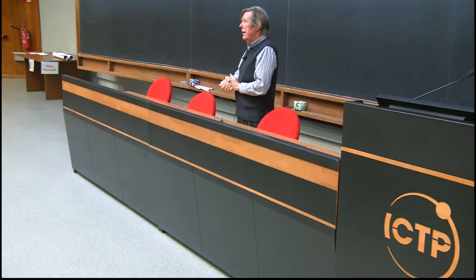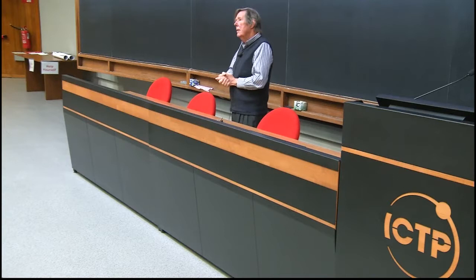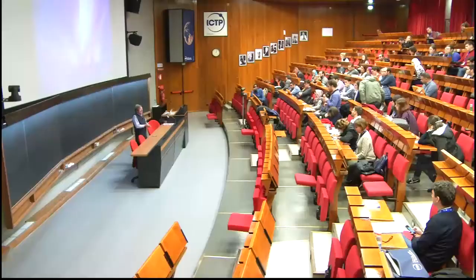Can you? No. The direction of the illuminating light in fluorescence is always the same. You cannot play with it. I don't think so. Can we? Can you have fluorescent dark field? No, you can't. That wouldn't work. Okay, so you're not going to get that factor of two improvement. Thank you. I think you're left with a missing cone, probably.